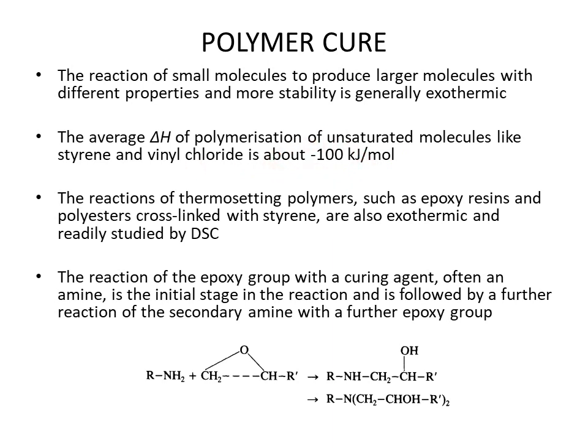Then further, the reactions of thermosetting polymers like epoxy resins and polyesters cross-linked with styrene are also exothermic, and these have already been studied by differential scanning calorimetry.